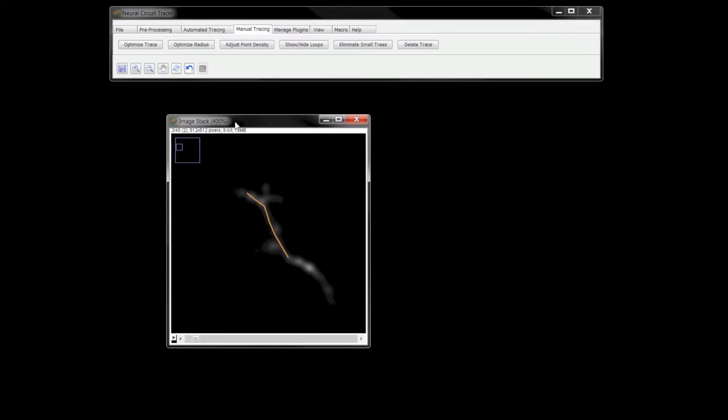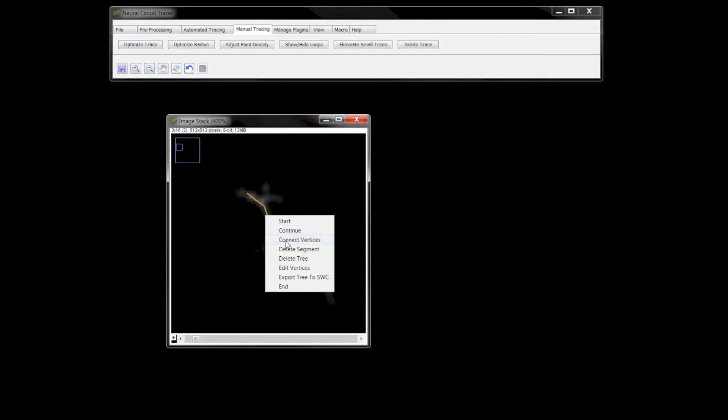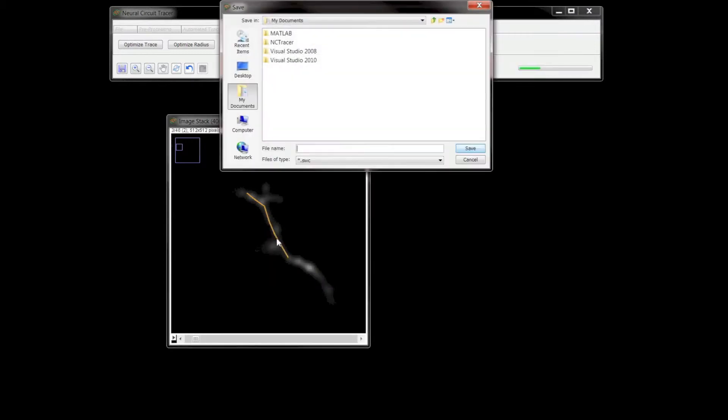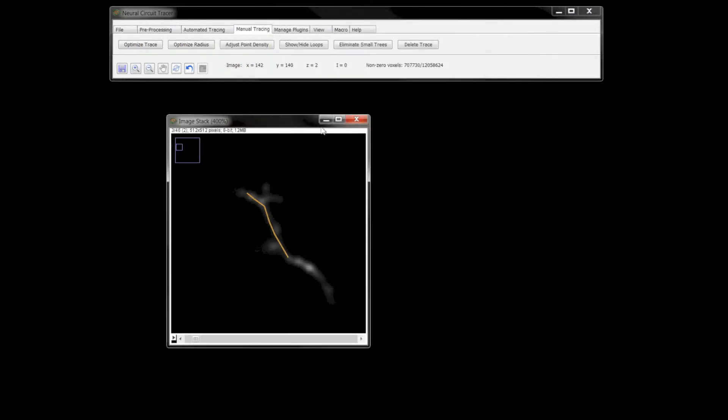Individual trees or the entire trace can be stored in the .swc file format for later use. One can also save the image stack along with the trace in the same file in the form of a .mat library.